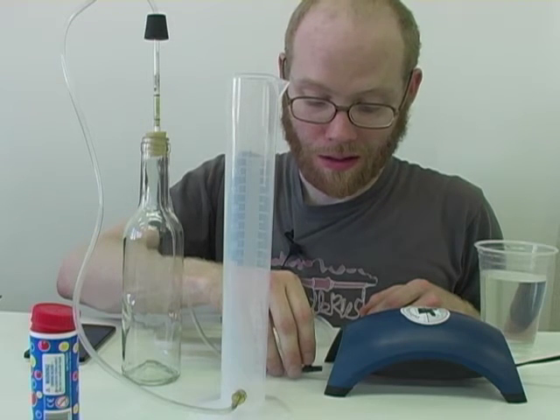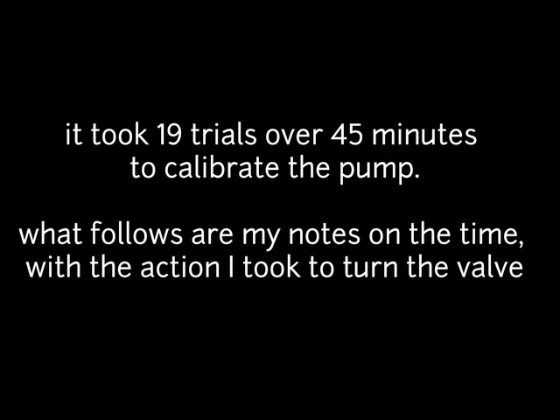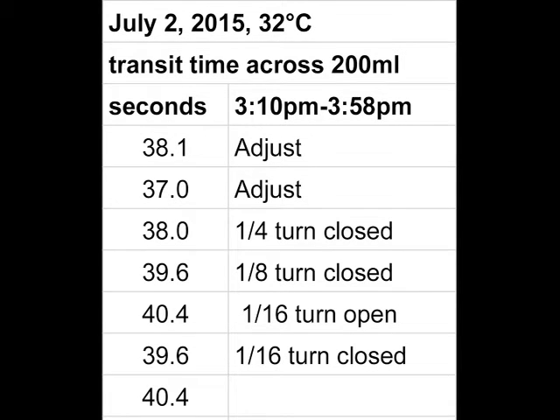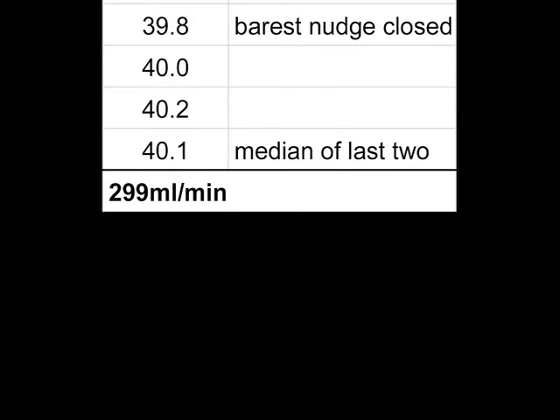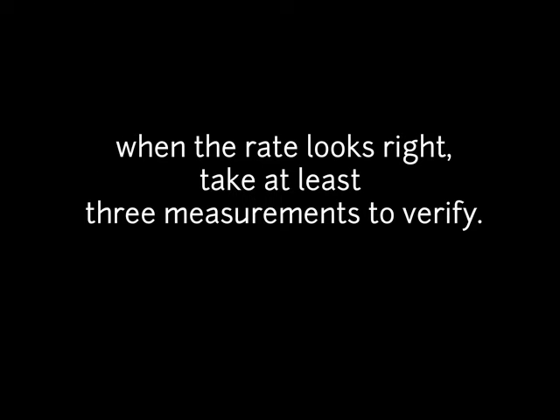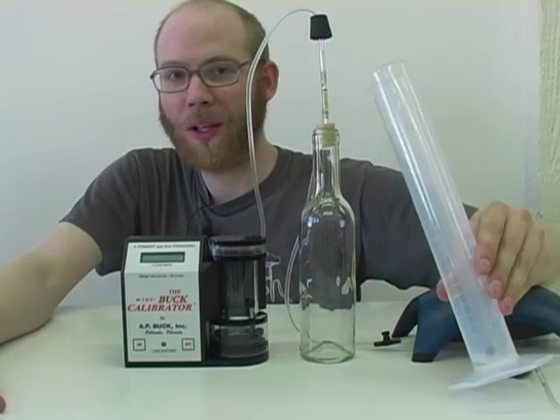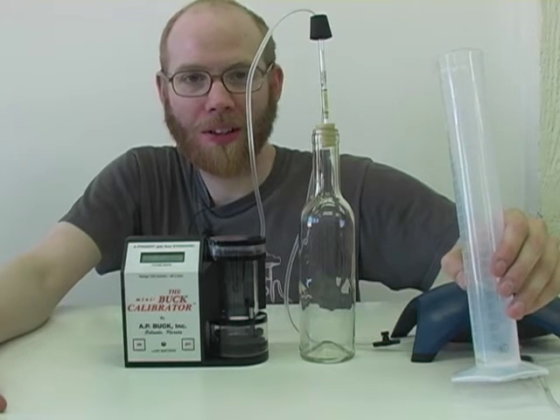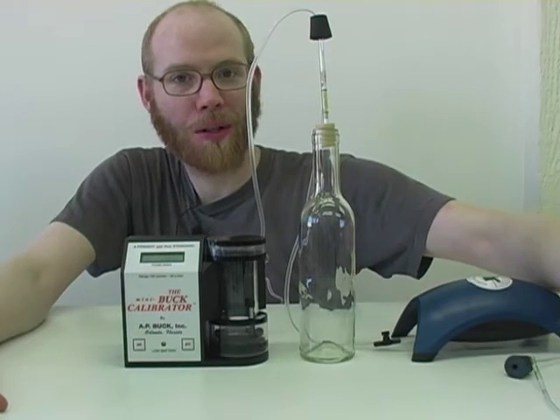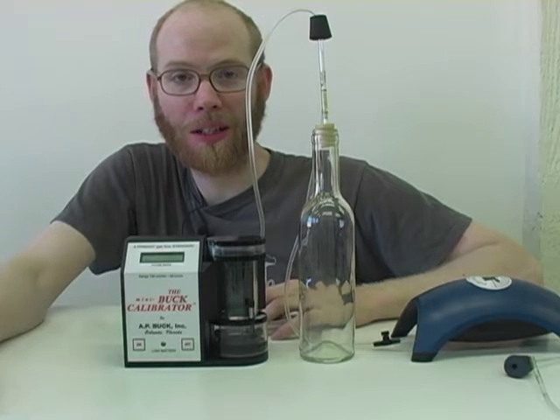I'm restricting the flow, only moving it about a quarter of a turn. With our graduated cylinder we timed 40.1 seconds to travel 200 milliliters, which is 299 milliliters per minute — very close to our 0.3 liter per minute target.